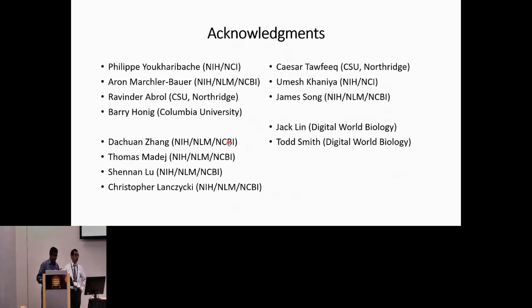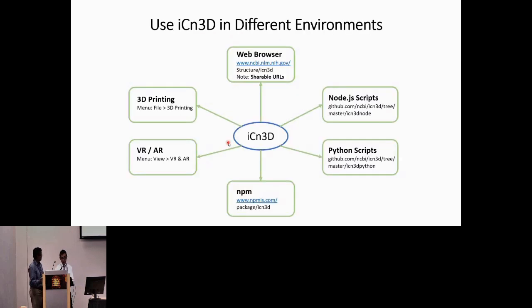Yeah, so Zhao, I have a quick question. Obviously iCn3D is a tool that you push updates to a lot. I was just wondering what is next, and what are some things that you're working on that we might see soon? Okay, so annotation is one of the major areas we're working on in iCn3D.